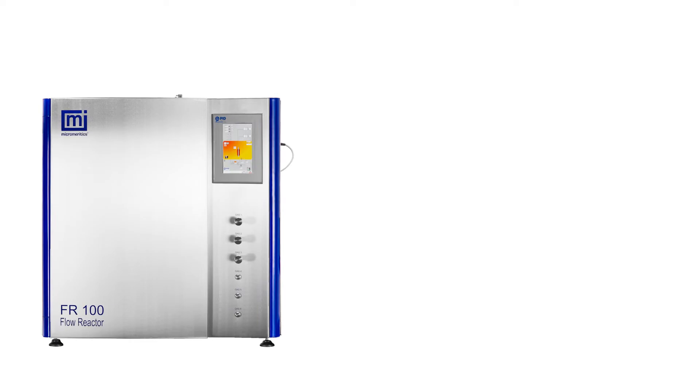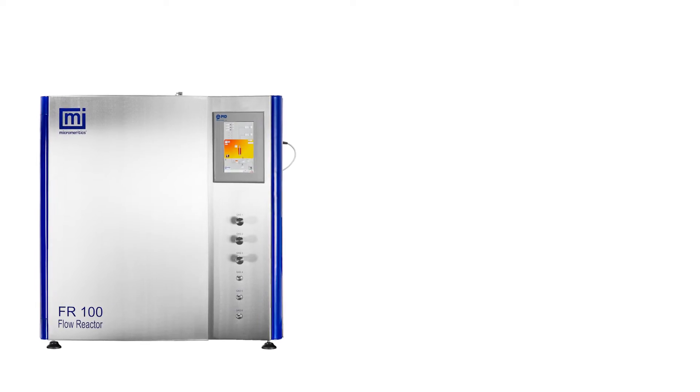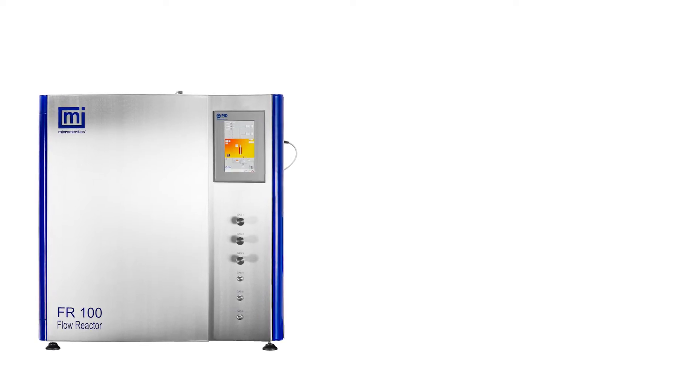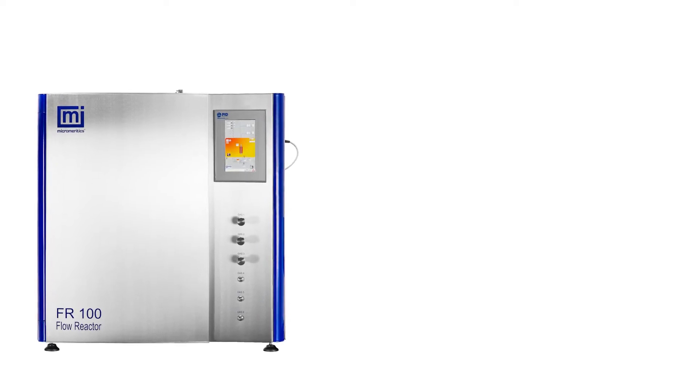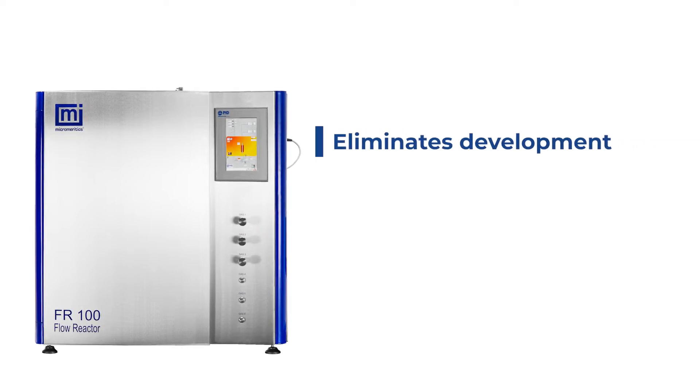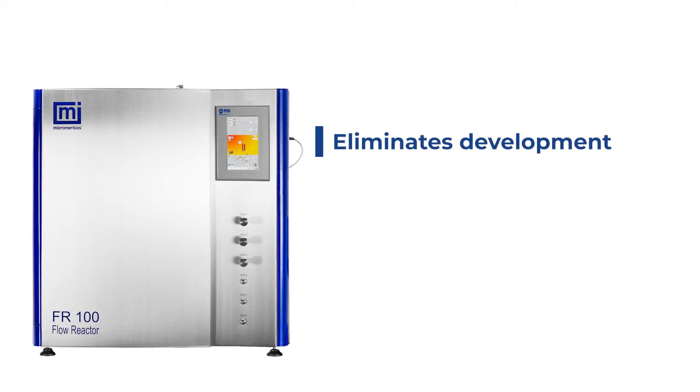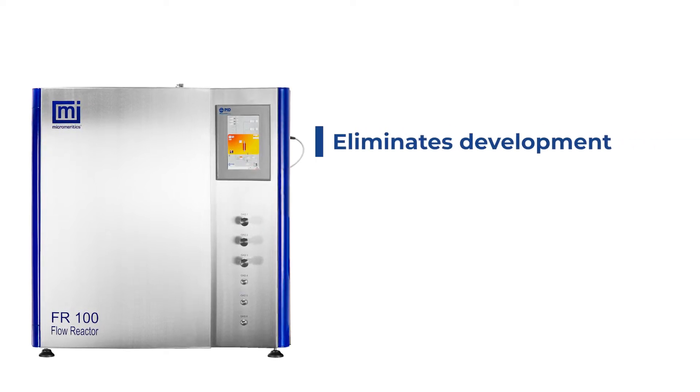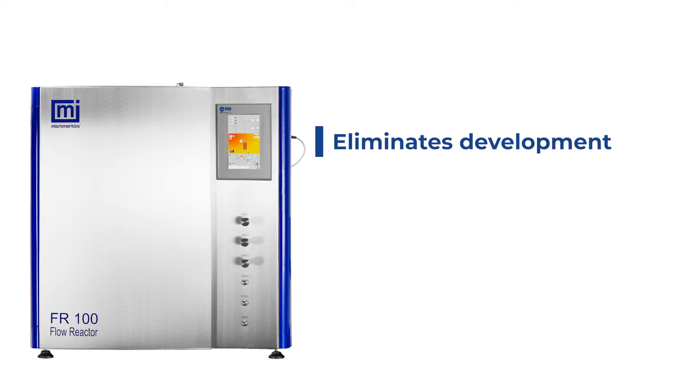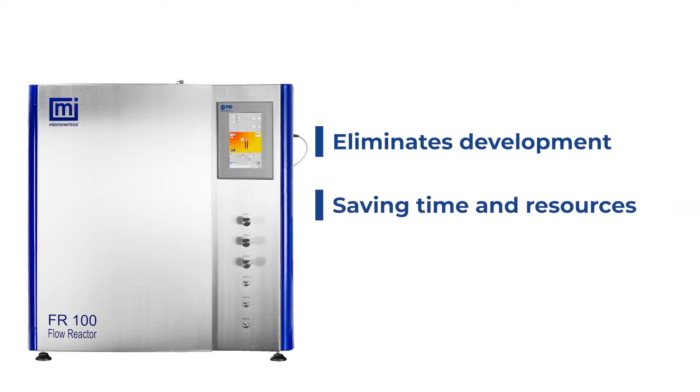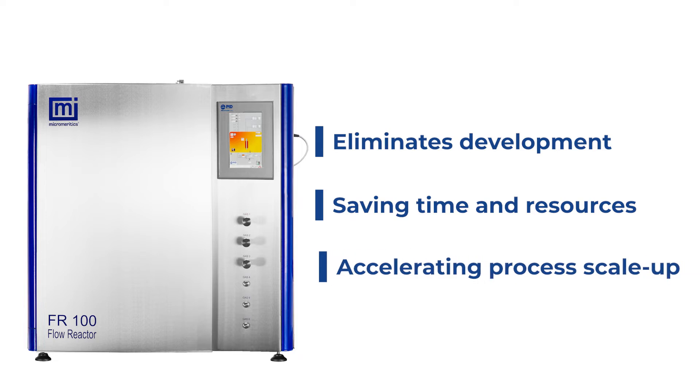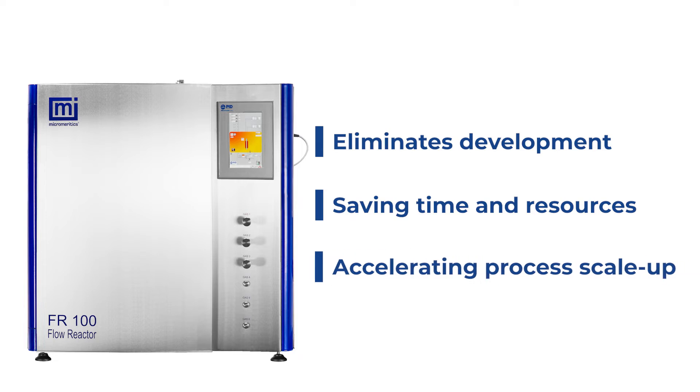The new FR100 reactor system from Micromeretics jump-starts your lab's catalyst development program, eliminating hardware and software development. It is a robust, versatile platform designed to save time and resources at the catalyst development stage and accelerate process scale-up.